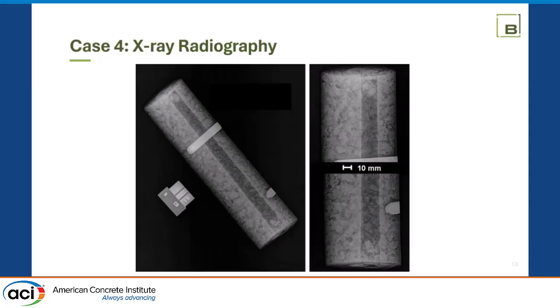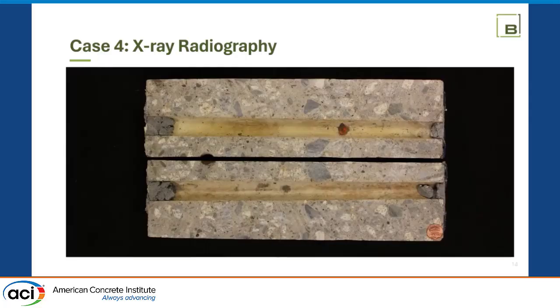And the reason why this is kind of funny is I was actually talking to my wife prior to making this PowerPoint presentation, and we were watching a detective show, and they'd scan the body with X-rays so that they could prove that nothing was damaged prior to the autopsy. And I told my wife, that's exactly what I do. So that's an example of it, so that when we actually cut it open, we can see they did not grout it. There's just stuff on the end. So it would prove before I even cut into it that there was nothing there.